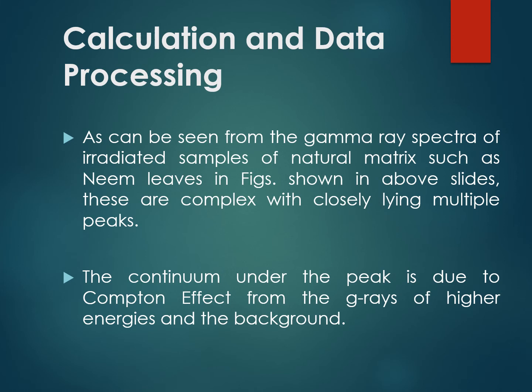Those multiple peaks that are lying one on the other, or coinciding with each other, can also be interpreted by using digitalized ways, or a computer can actually determine the percentage or composition of the substance by interpreting automatically all those graphs.